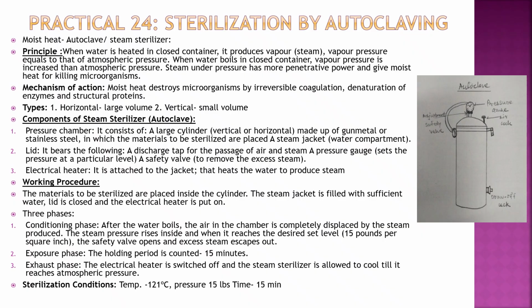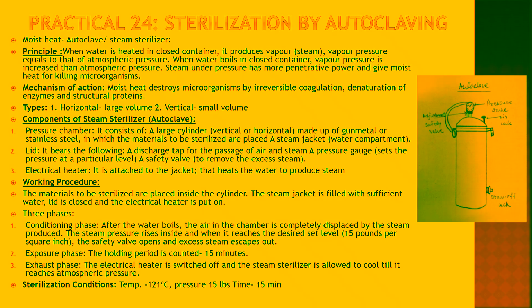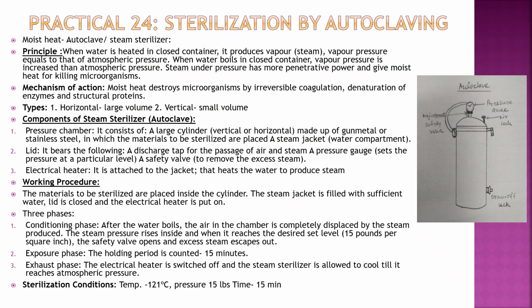Hello students, let's study moist heat. So in that we will see autoclave in detail. It is also called a steam sterilizer. The principle: when water is heated in a closed container, it produces vapor and then it causes vapor pressure. Then when water boils in a closed container, the vapor pressure is increased more than the atmospheric pressure, and then it has a more penetrating power to kill the organisms.